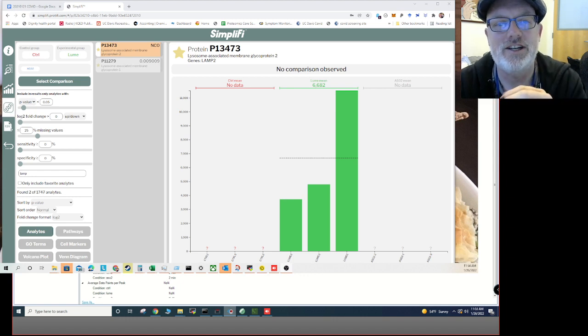This I just did yesterday, so I thought I'd do it fresh in my mind. I don't actually know when I'm going to publish this because I think we're going to wait for the paper to be published. But this was with a group that we've been working with, and we are in the middle of publishing the paper, and one of the reviewers is asking us for basically some evidence that their controls were not contaminated with some of their preparation proteins.